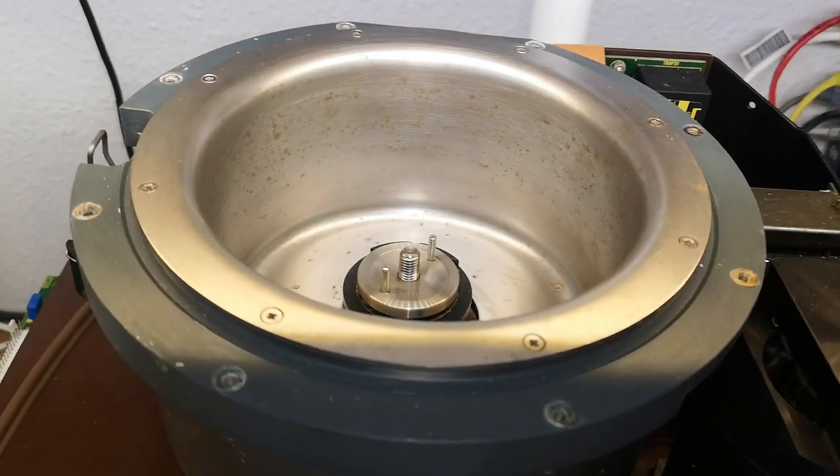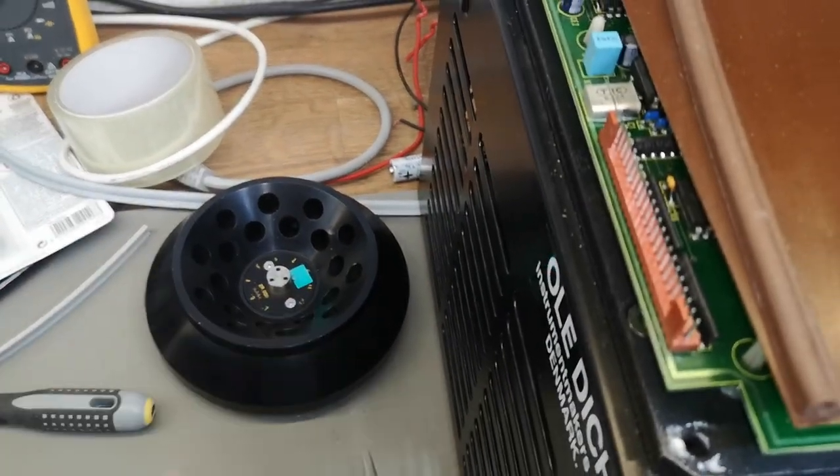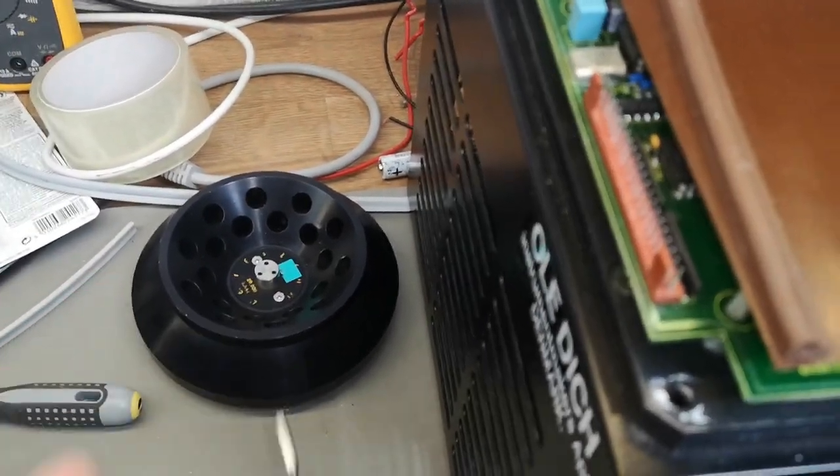There are two switches — why isn't one enough? It's because of a double safety feature in this unit, since it's very dangerous to open when the rotor is spinning. You can imagine the kind of energy stored when this is rotating really fast — an amazing amount. Definitely you want two switches.